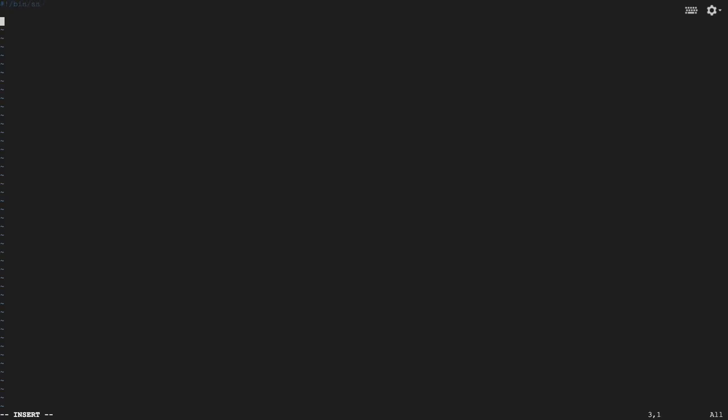To start things off, I'm going to include a small shebang statement to make sure that this is executed as a shell script, and then I'm going to start defining these positional arguments, the first of which is a RAxML input file, the sequence alignment to build the maximum likelihood tree from. So we'll have that be the first positional argument from the user. Next is the expected output file name and path, and we'll just call that RAxML output and set that as the second positional argument defined by the user.